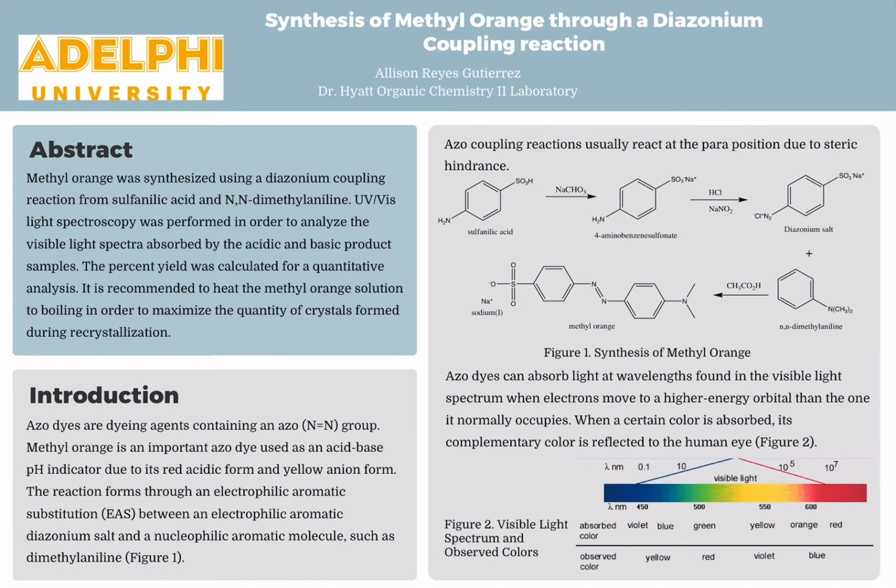The diazonium coupling reaction consists of an electrophilic aromatic diazonium salt, which is then reacted with a nucleophilic aromatic molecule, which is our N-dimethylaniline. Azo-coupling reactions also tend to react in the para position due to steric hindrance from the bulky aromatic molecules.